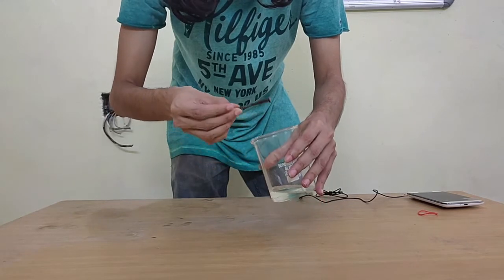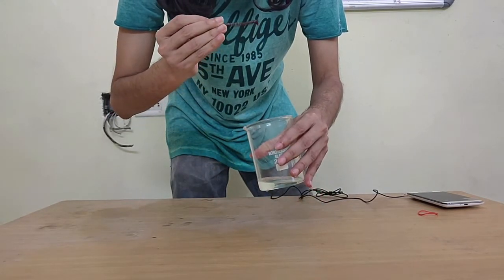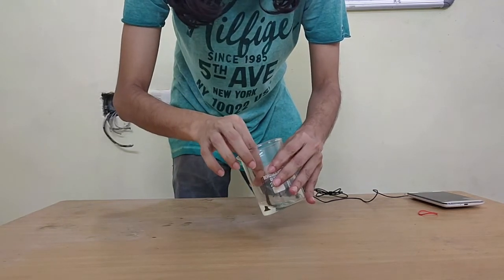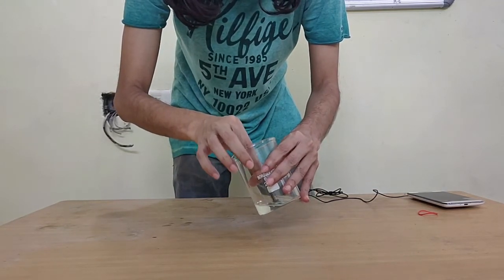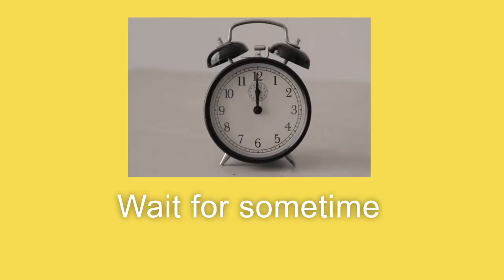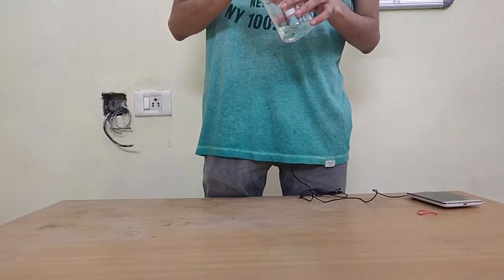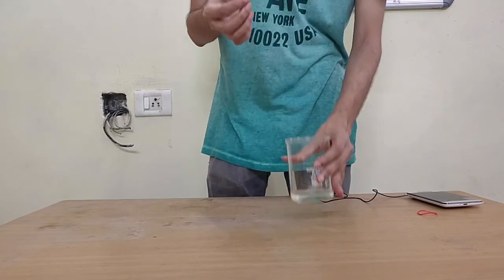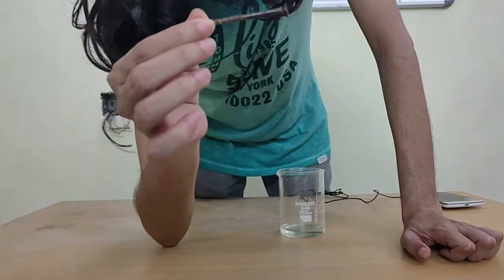Now I'm going to start to notice something right here. I think it's about done, so let me just show you. Let's take a look at this acid now. Now I want you to observe this nail very carefully.